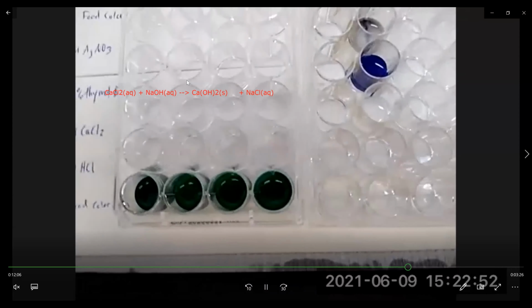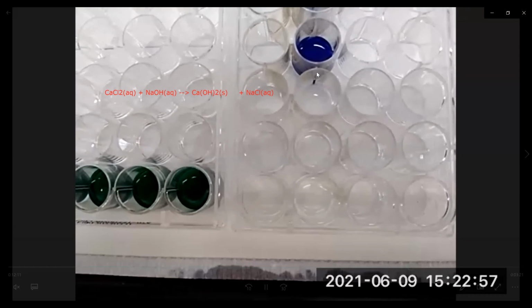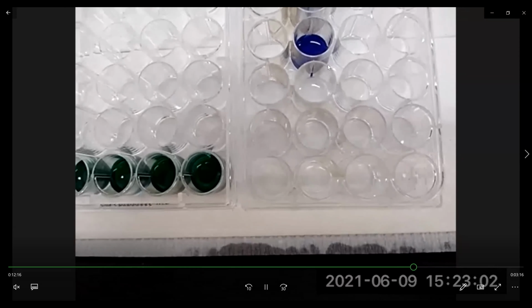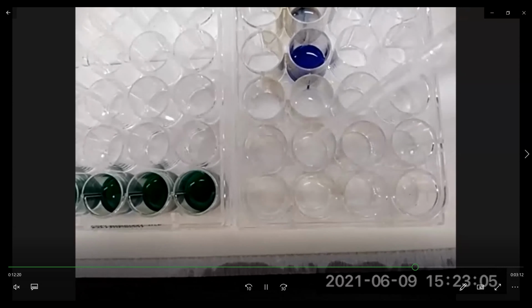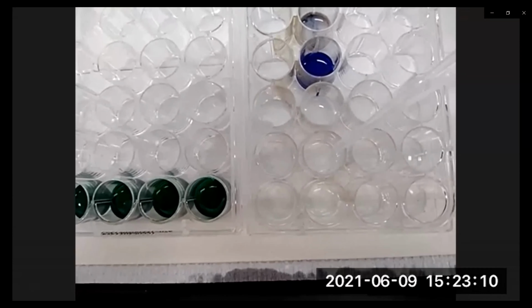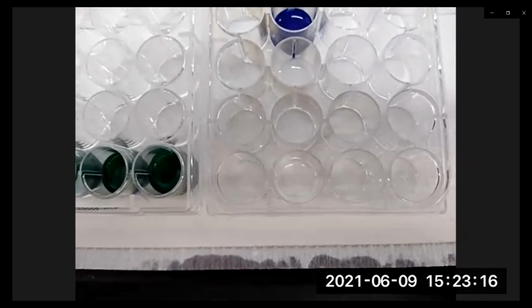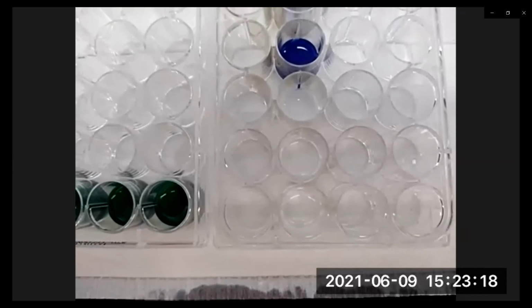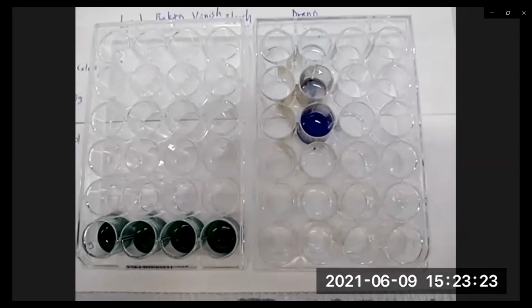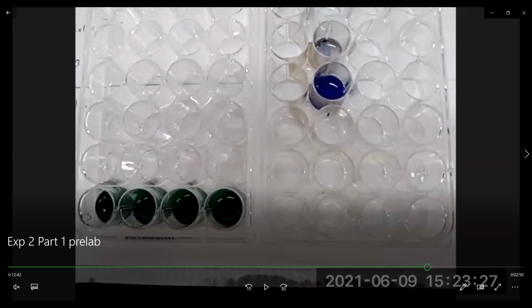And then next, we're going to add the 6 molar HCl and see what happens to the Drano. Remember, Drano is very basic. HCl is acidic. So we have an acid-base reaction occurring. These are actually pretty exothermic reactions. So if you were to use a thermometer and measure the temperature, you might notice that the temperature has increased.